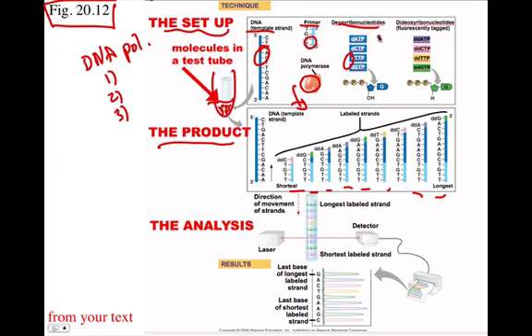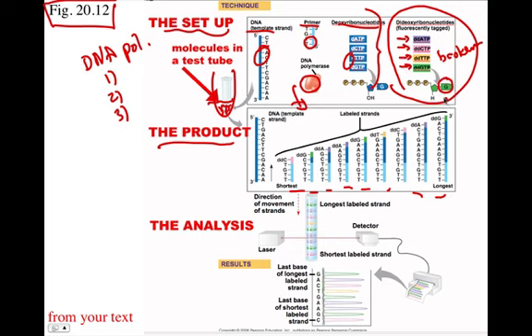And here's what's going on. In addition to the normal nucleotides needed by DNA polymerase to get its job done, these are also added, and these are like broken or defective nucleotides. And they each have a corresponding unique glowing color associated with them, so that extra tag of a fluorescent label. Another name for these is chain terminating, and that's how they're broken or defective. If one of these gets added, the chain stops growing. And so that's depicted here.